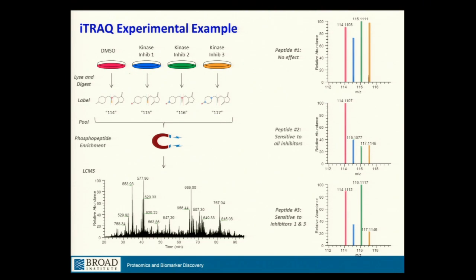That's right. So the question is, this is not protein specific, is it? And in fact, you don't want it to be. You want every single peptide in your protein digestion to get an iTRAQ label on it. And if you don't successfully label all of the peptides, then you have an even more complex sample, because you have 2 versions of every peptide floating around in your sample. Did you have a follow-up to that? So would this depend on whether or not the protein is able to be labeled by these isotope tags?